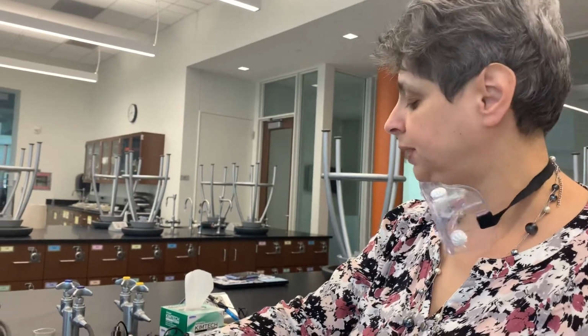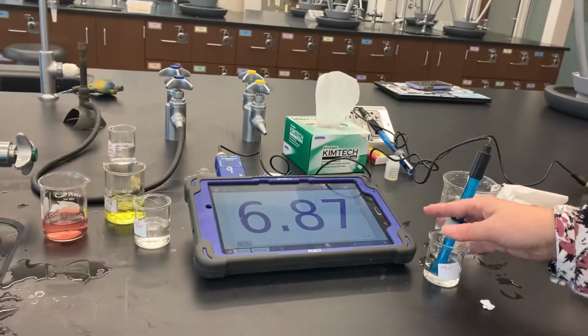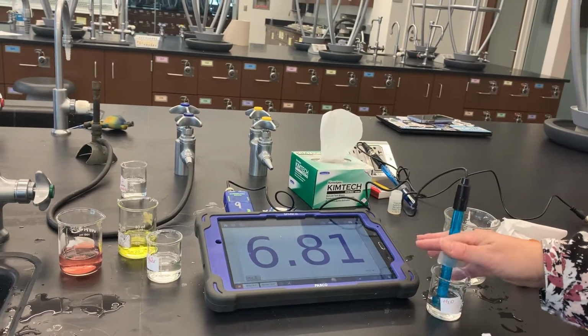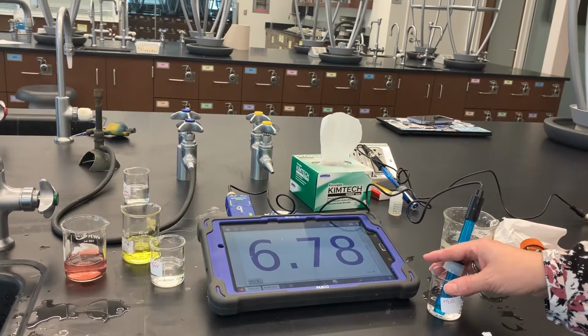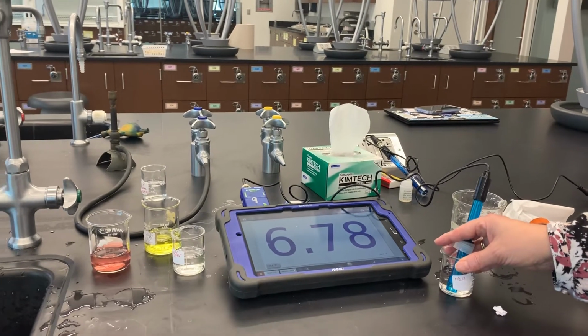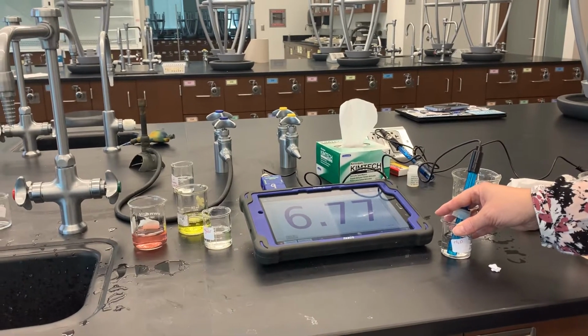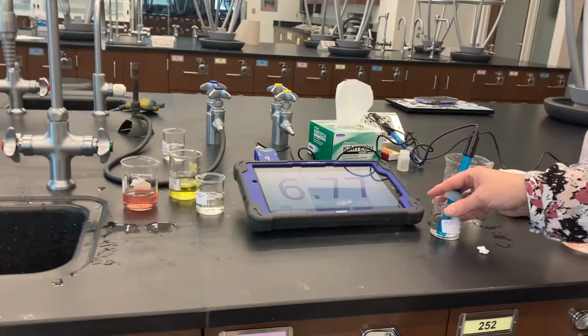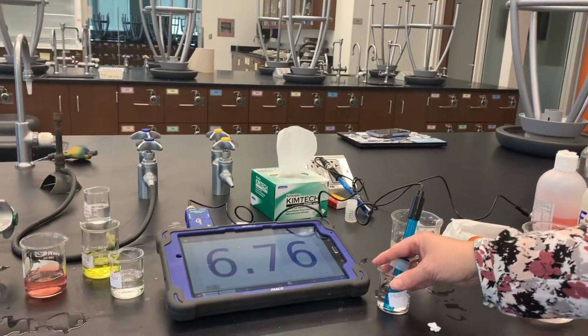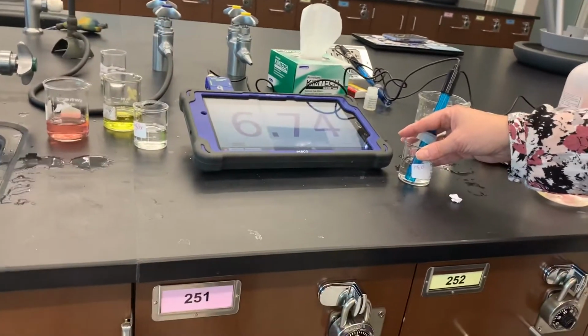And for measured pH, take a look here. I have about 6.78. So a little bit on the acidic side, which is not uncommon for DI water, for the reasons of how it's being prepared from tap water. So really close to pH of 7.